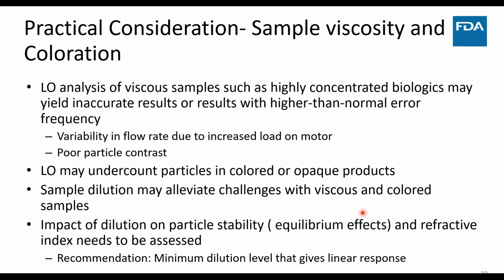The recommended approach is, if needed, to use the minimum dilution, but you also want to make sure you're working within the linear response, meaning you want to look at a calibration, you want to look at the impact of dilution on your count. If your dilution at a certain level is not giving a linear response, it means you really cannot use that in estimating your particle count in your actual product.